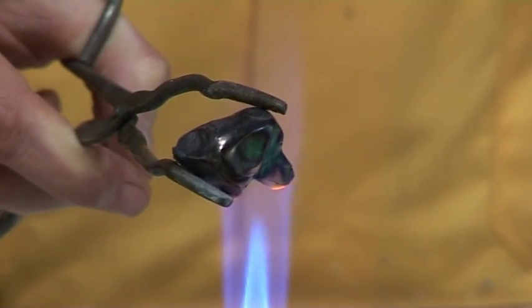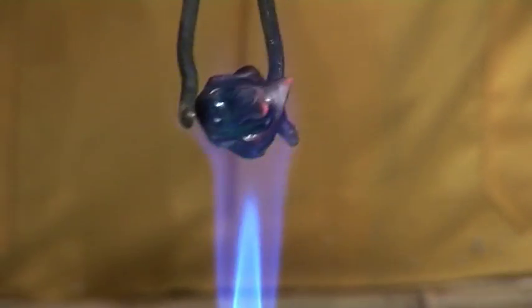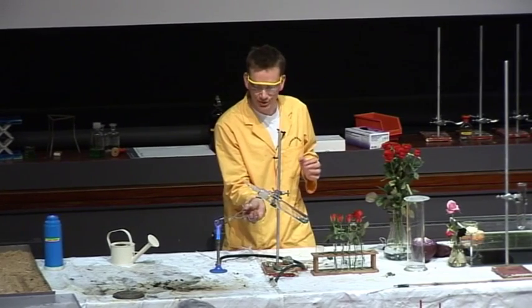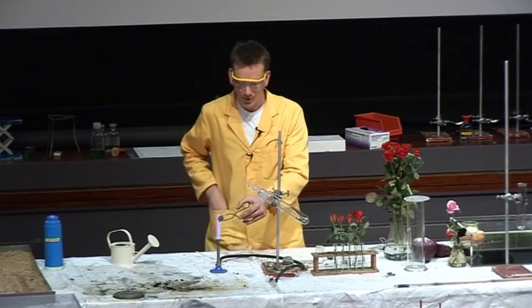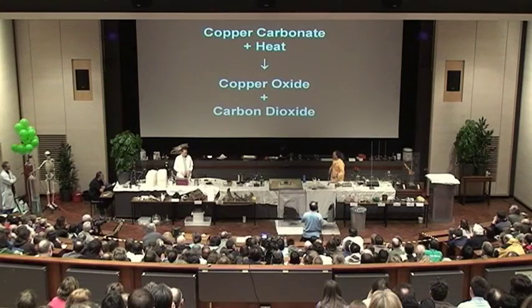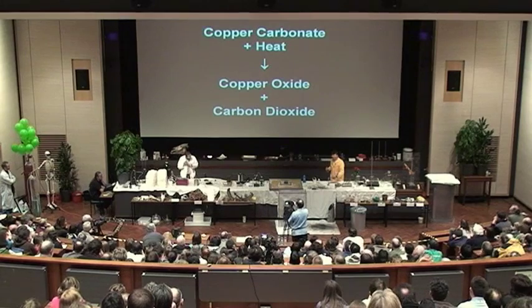Already you can see that the bottom of the malachite here we're getting a black colouration, as the carbonate is decomposing and forming copper oxide. And we can look at the equation for this. Copper carbonate plus heat forms copper oxide and carbon dioxide gas.